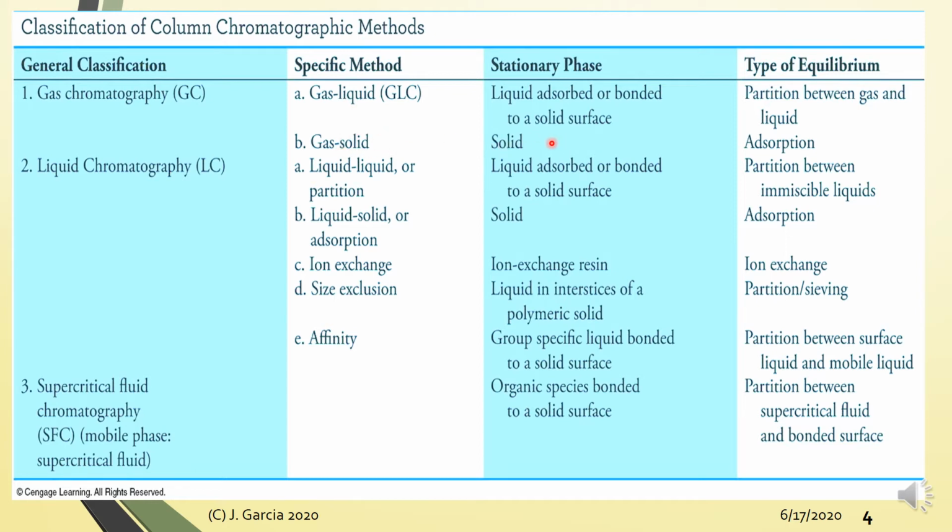Now, an important thing to remember is the type of equilibrium or the type of interaction that you have in these particular chromatographic techniques.